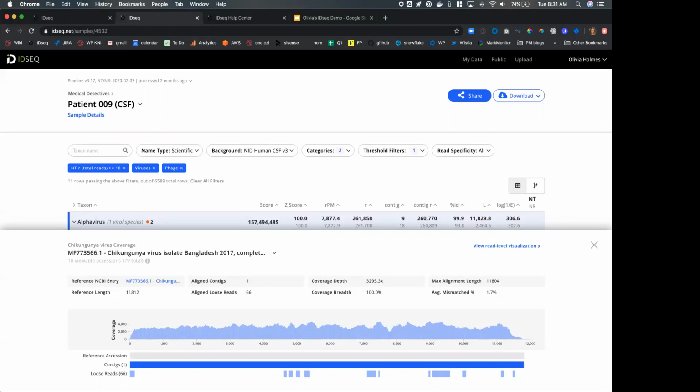Oh, can I download the mapped viral sequence? So what you can do is you can download the contigs here. All I did here was I just highlighted over the contig that I'm showing in this visualization, and I can actually just click on that download contig FASTA.